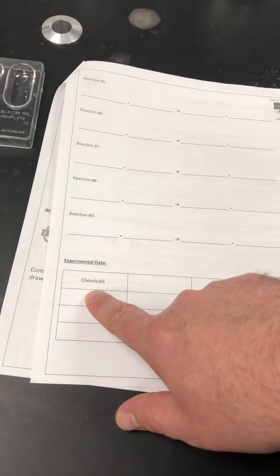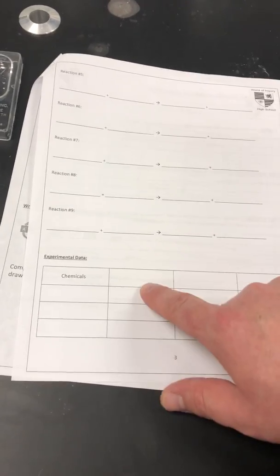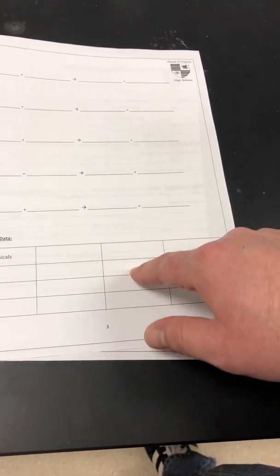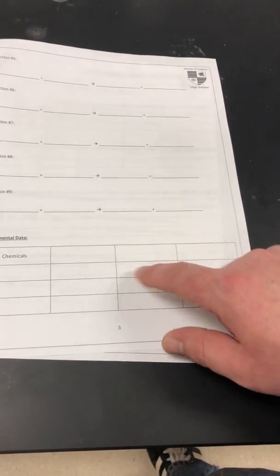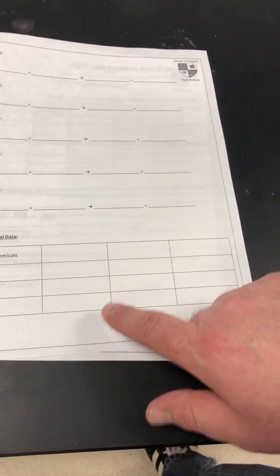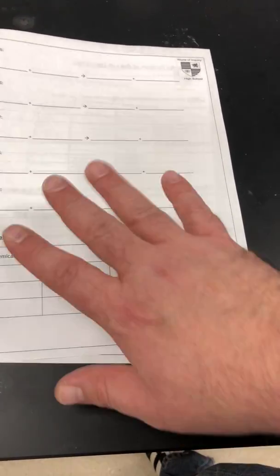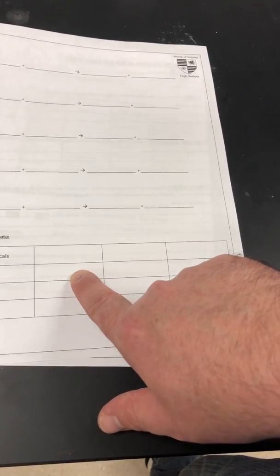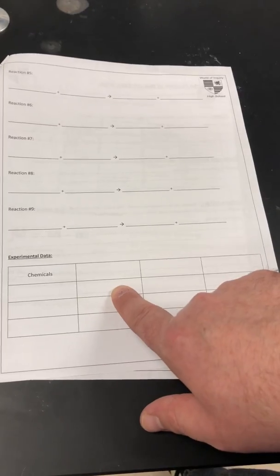Box 1 will be this chemical combined with this chemical. And if this is your box 2, then it's this chemical combined with this chemical. That's where your reaction is going to happen. In this box, after you number them small in the corner, when you actually do the lab, you're going to write yes, I saw a precipitate, or no, I did not see a precipitate. And that's your data, just yes or no.